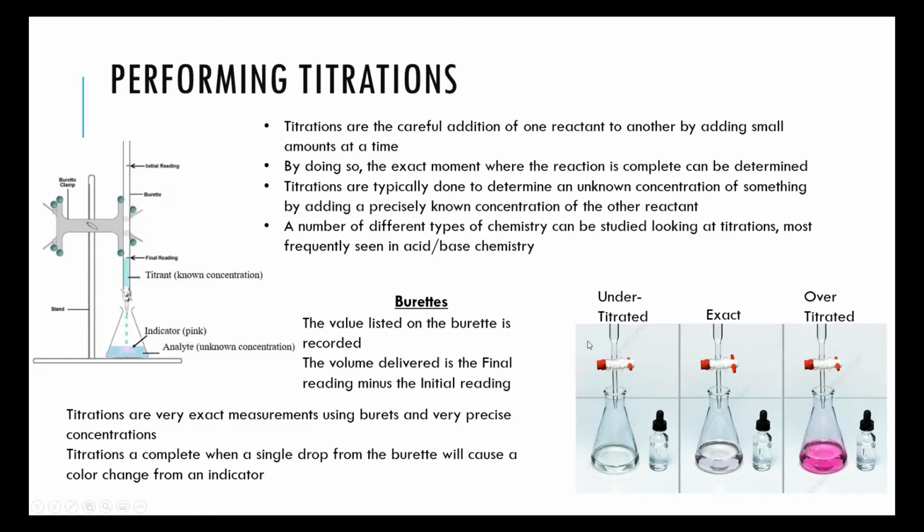But when you're performing titrations, in theory, what you want is where a single drop from the burette will permanently change the color of the solution in the flask.